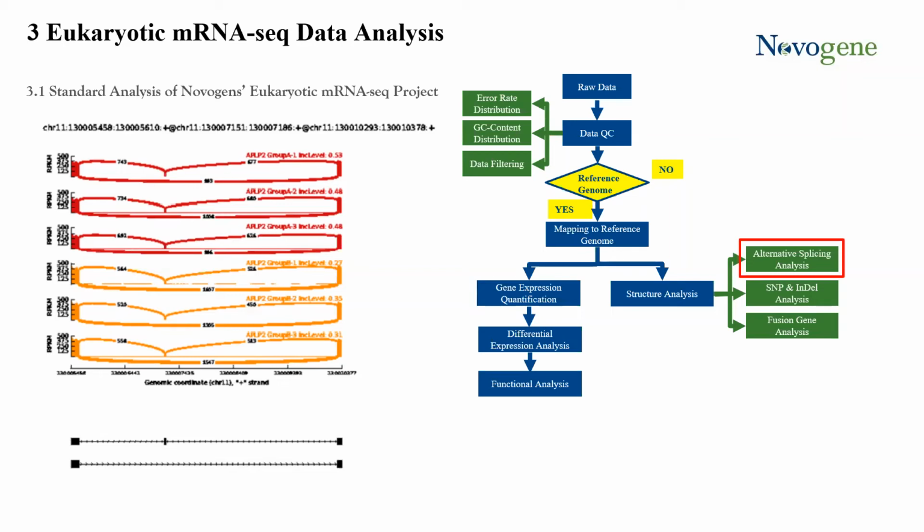We also had 677 reads that contained the end of the middle exon and the beginning of the last exon. Whereas on the bottom part, we represent the exon-skipping isoform, which had, in this case, 963 reads containing the first exon and the last exon. This plot gives us an idea of the different isoforms present in the sample, as well as their amount.